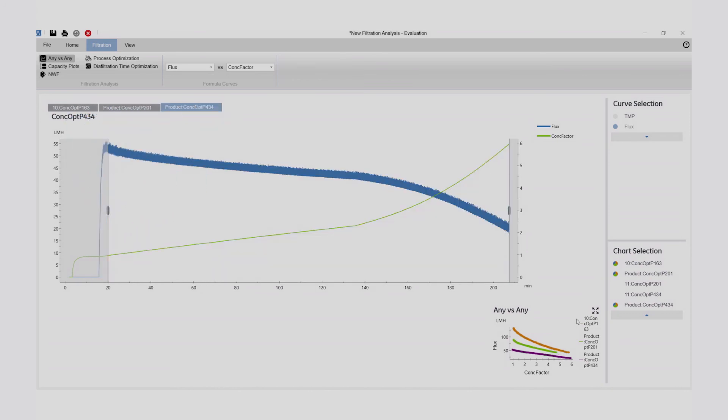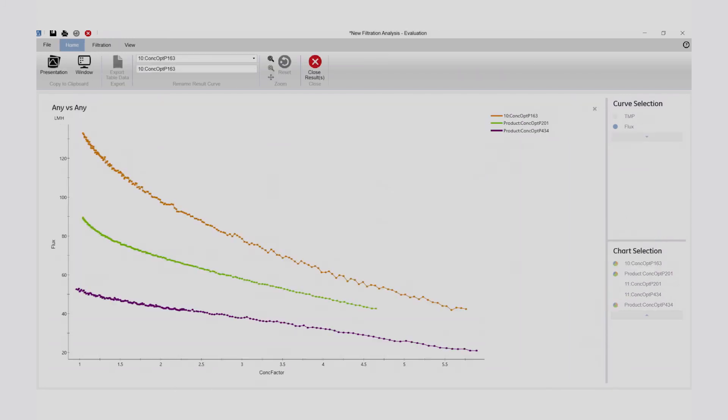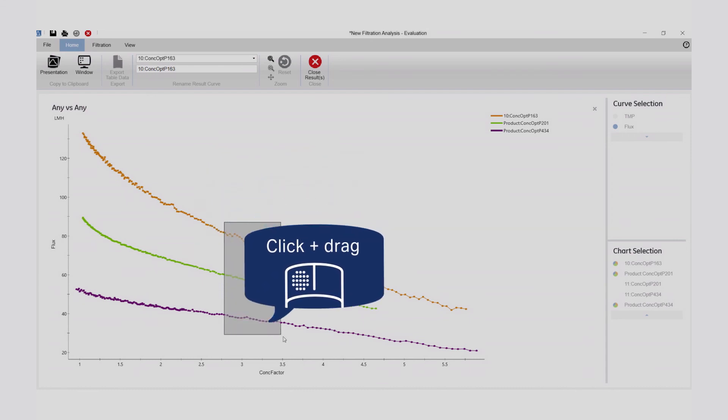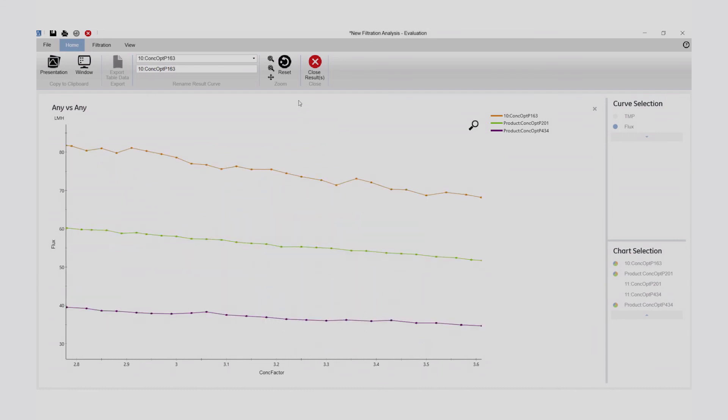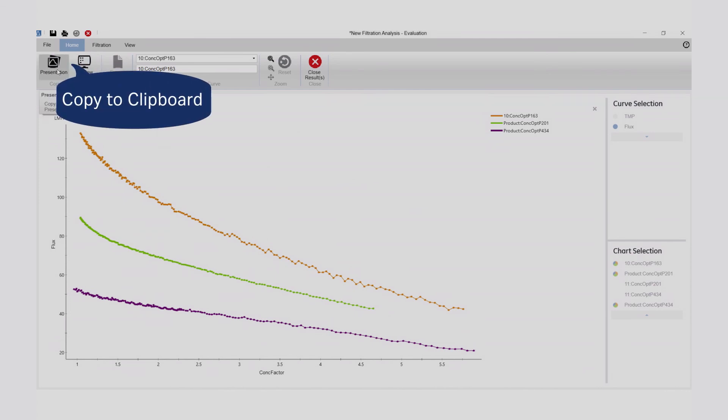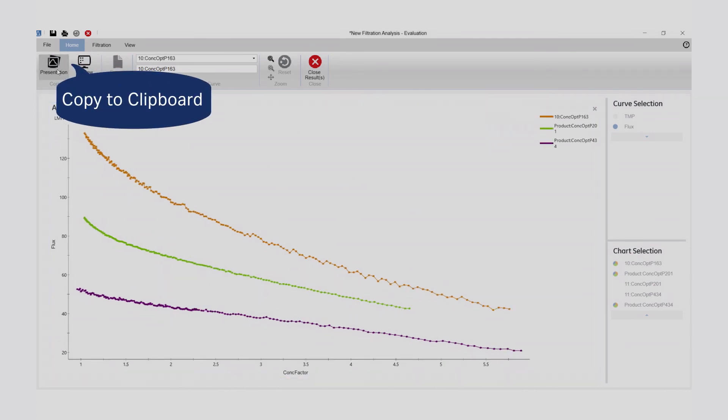Analyzed data from the selected area in each plot can be viewed in the result view in expanded mode. And for a more detailed view of the data, zoom in. Sharing your results is easy. Just copy and paste your results into your application.